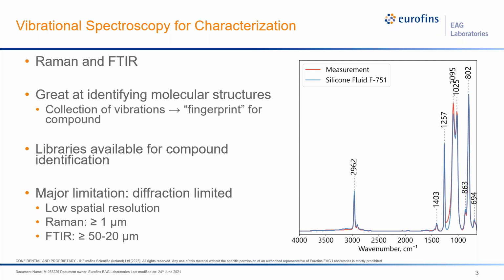So this is very powerful if you have, say, a contaminant or some material that you just want to find the identification of. You can send it to these types of vibrational spectroscopy. And often it can tell you either the exact compound or the classification of compound that it falls within.